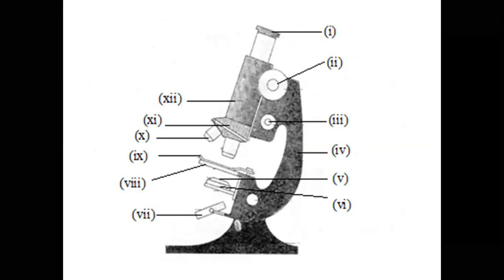And how do you ensure that our microscope is well lit? Number one, you make sure that the eyepiece lens and the objective lens have clicked in position. You know, that's the key, that both eyepiece lens and objective lens have clicked in position. Number two, you make sure that the diaphragm is open. Most students struggle with a microscope whose diaphragm is closed. And you see, the diaphragm is the one that regulates the amount of light entering the stage.